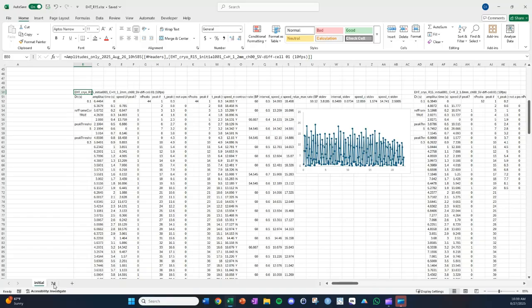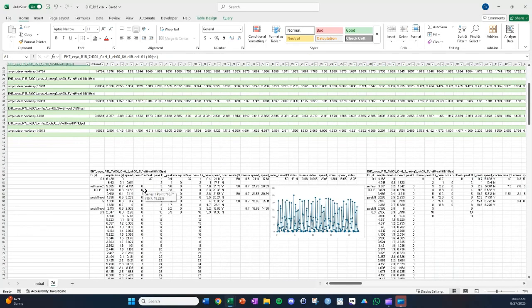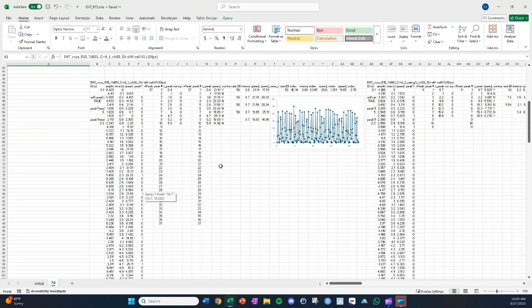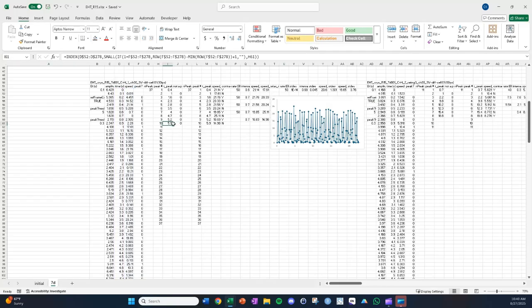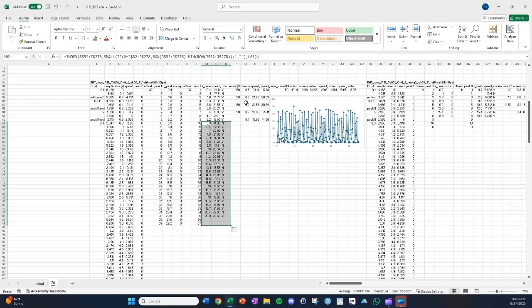Typically post-treatment, they can get to be harder to analyze because I'm doing stuff that might make the tissue less healthy. This one post-treatment actually looks pretty good to me. Looks pretty similar. Let me just copy and paste like that.